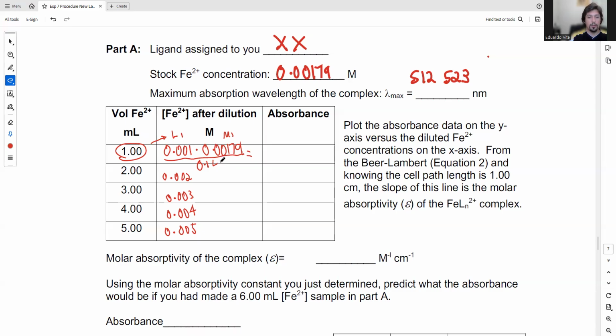And then this is your volume number 2, 100 mL, because remember we took this Fe2+ and we diluted it to 100 milliliters in the flasks. And this is going to be your volume 2. So again, M1V1 = M2V2. If you do that, you should be able to get the number for all of those. You just replace your V1. Everything else should stay pretty much the same.